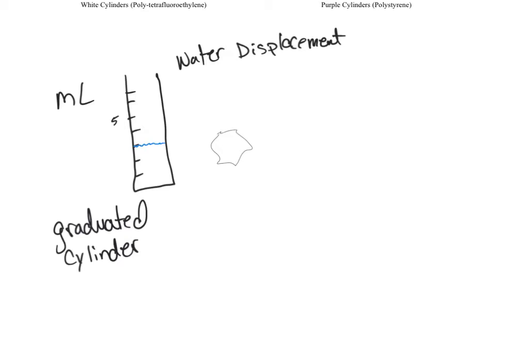Okay? And we placed this object into the graduated cylinder. So now we've got that object in there.